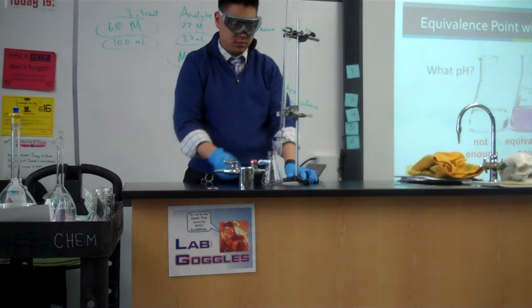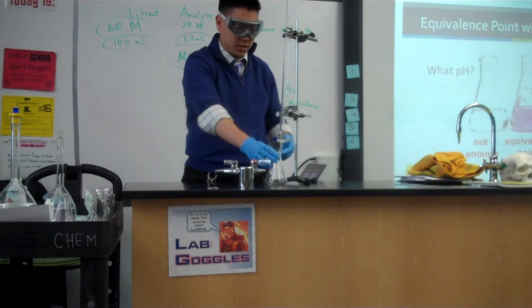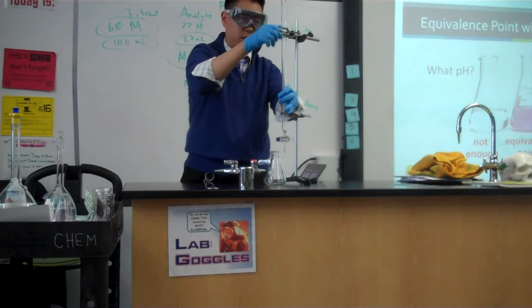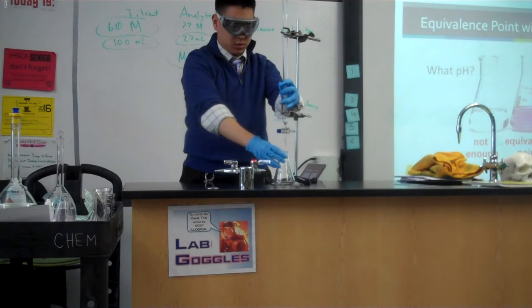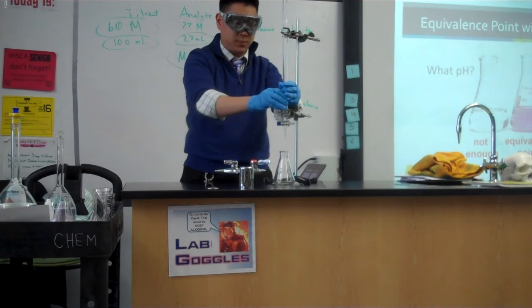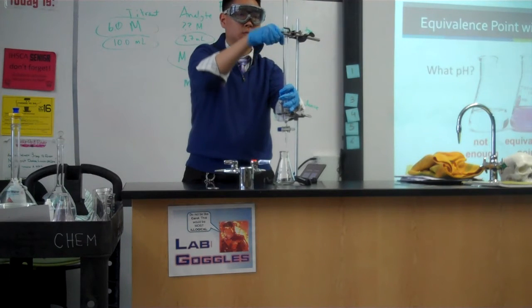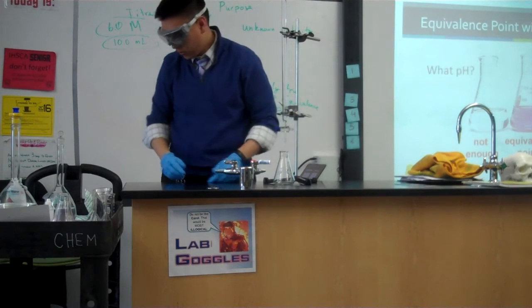For our purposes, do we notice that this is already too low because we can't get this past it? So we want to actually make this a little bit higher. So we want to be able to fit this underneath, but we don't want it to be dropping from too high up. So just enough for clearance. All right. Spill tray.